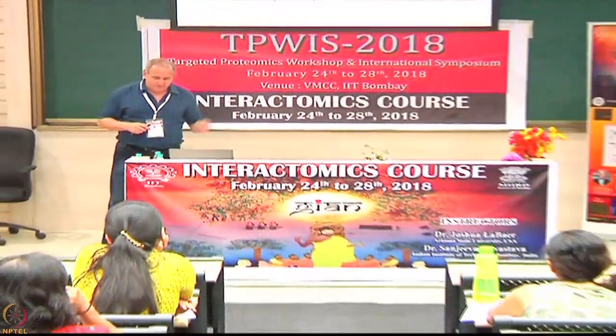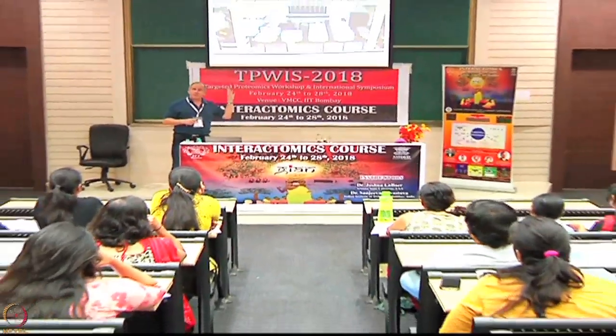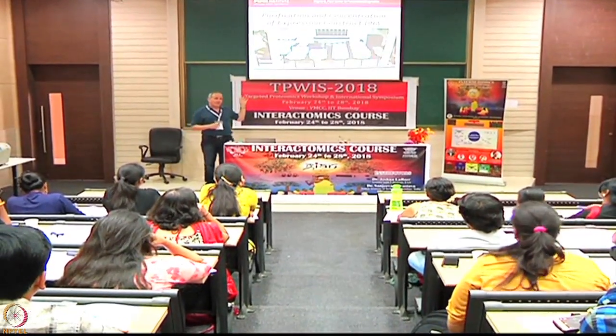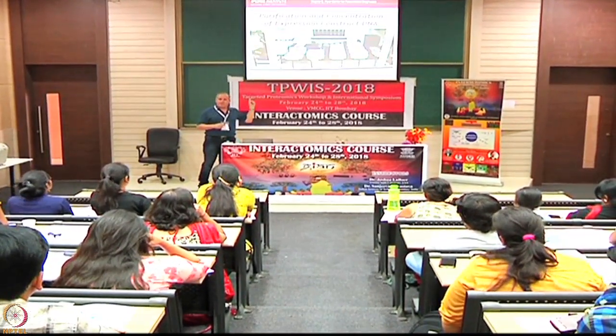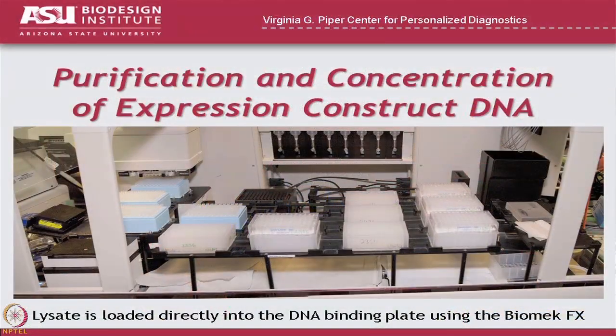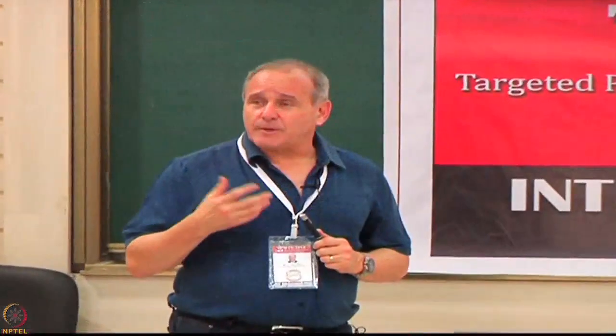So this is the method that we used to use to purify the DNA. Those of you who know Sanjeeva, this is when he was in the lab, this is how he did it. This is an automated platform. We had worked out using a robot how to do DNA mini preps using robots. And that allowed us to do, if you were really working hard, about 600 a day in a team approach. That was not easy, but you could do it.